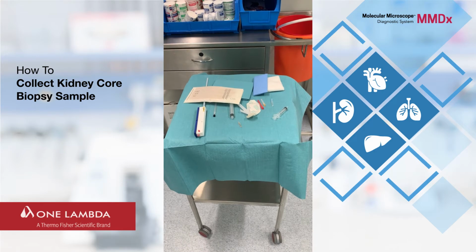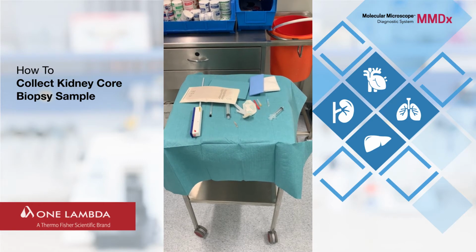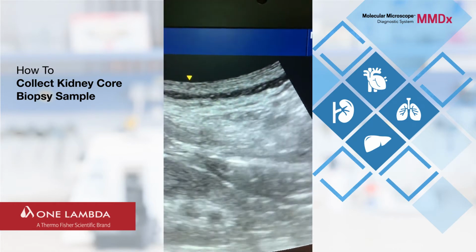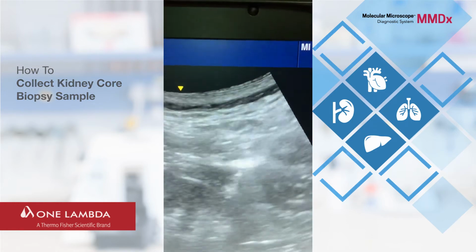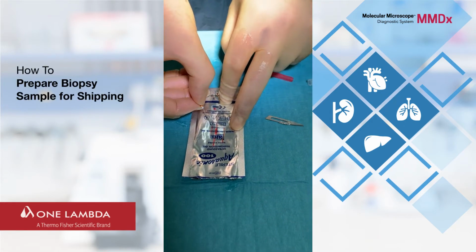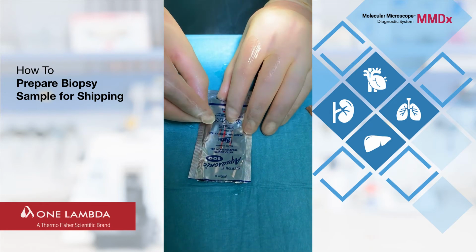You will need a blade in order to dissect the kidney core to provide the 3mm segment for the molecular microscope. So we've done the biopsy and we've got 2 cores of kidney here and here, and we need 3mm of one of the cores. So we'll take it off the larger core.